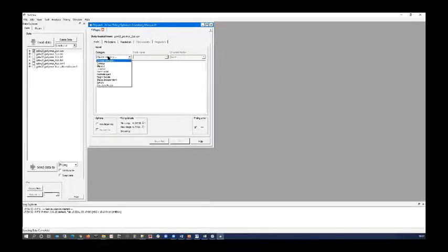So I'm going to go into my model categories here. I'm going to choose shape independent. These categories, incidentally, we've come up with a default categorization, but you can actually go into a category manager and completely reassign things if you want. So if there's only a handful of models that you ever use, you could create a new category, call it My Models, and just put in the models that you use for your analysis. You don't have to stick with these ones you see.